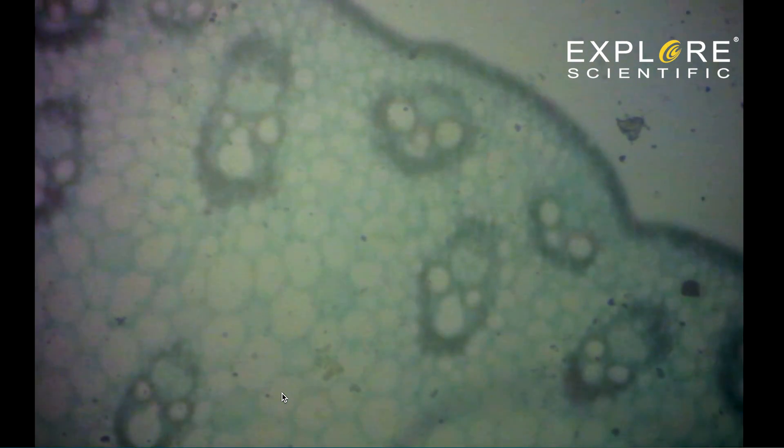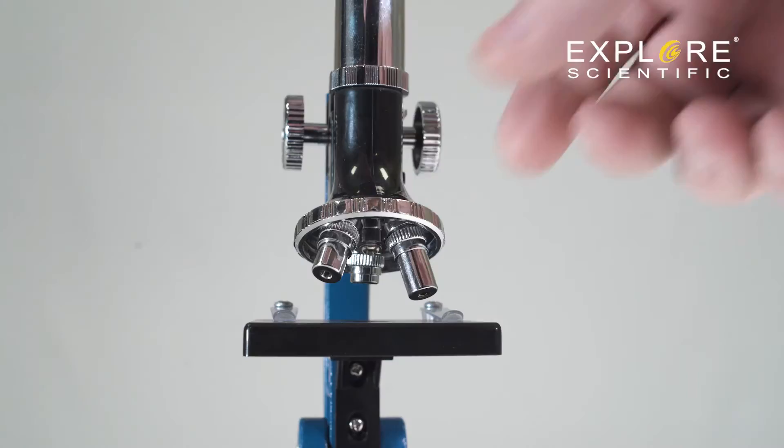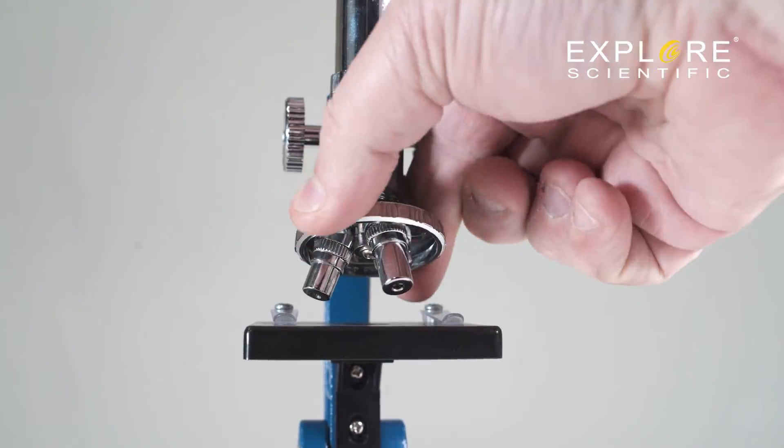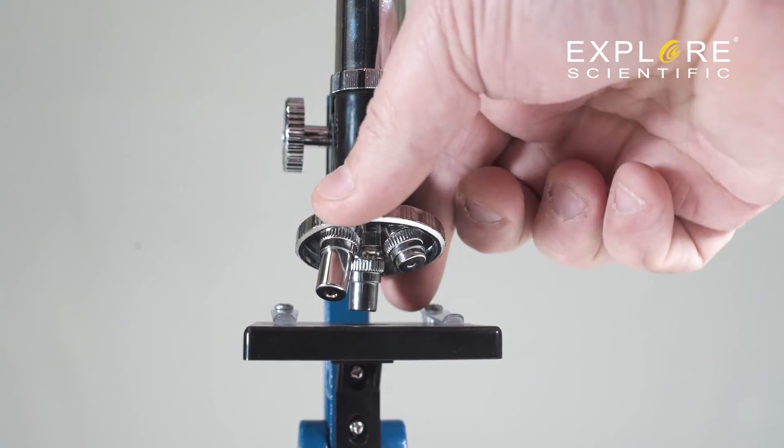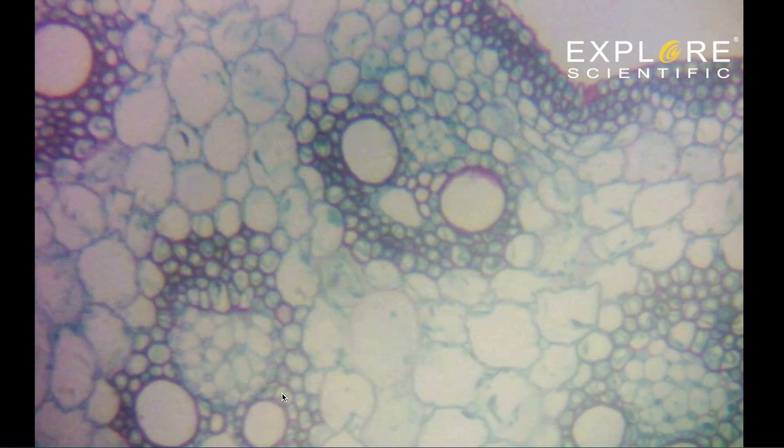Once comfortable with how the microscope works and with a specimen in focus with low power, turn the turret to rotate the next lens into place. Be sure to switch to the middle size lens because it's easier to go from low power to medium power than it is to go from low power to high power.